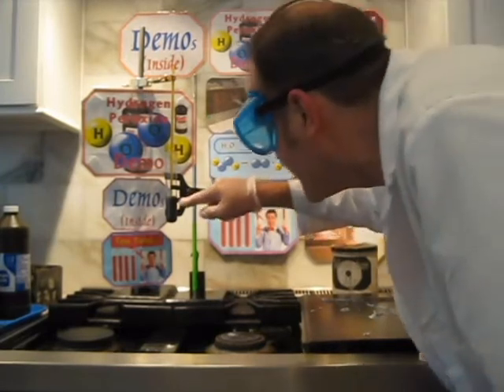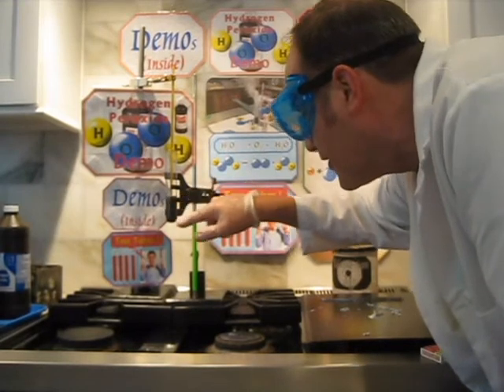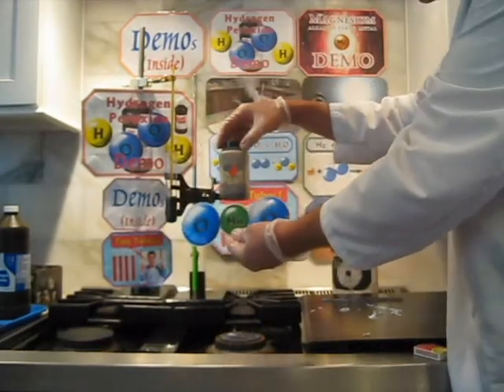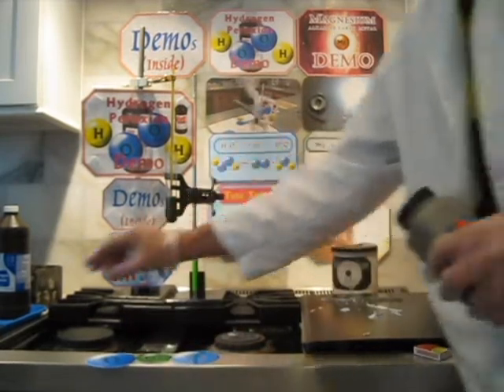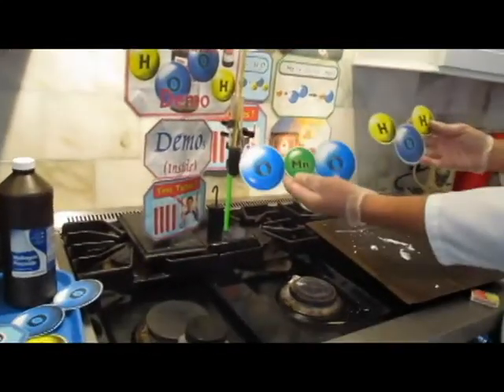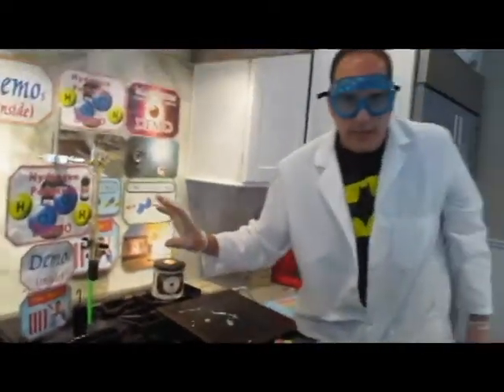So I think, and it's actually still bubbling just a little bit in there, getting close. And what's left in there is actually the catalyst, because catalysts are not directly involved in the reaction. Catalysts are still in there, and water. So if we used up all the hydrogen peroxide, then what we really have left in here when this is done is water and the catalyst floating around. It should settle on the bottom. So in a few minutes I'll get another shot of it after it has settled out on the bottom. Okay, thank you guys. Thanks for doing the demo with me.